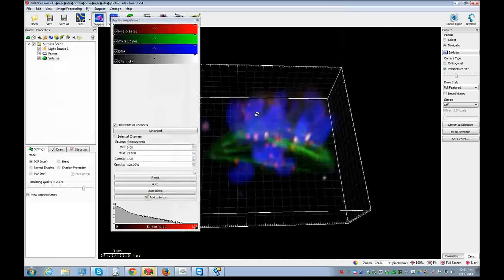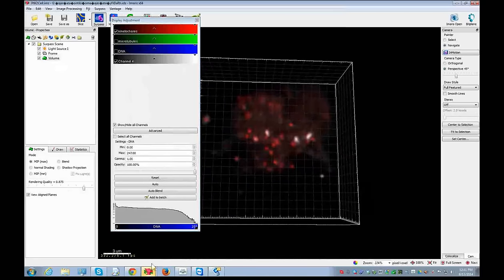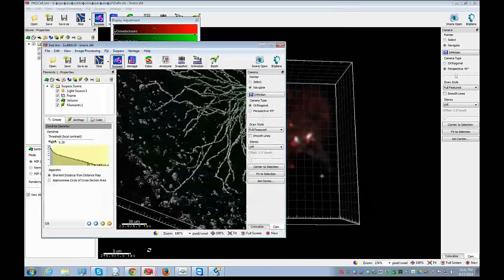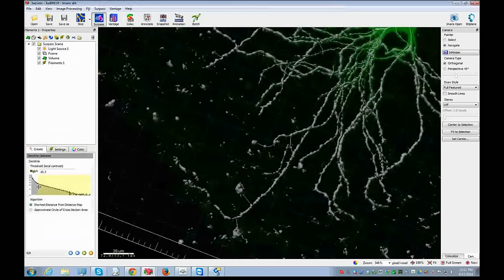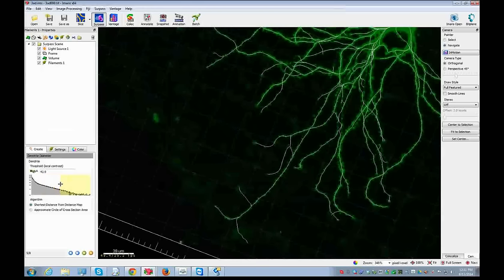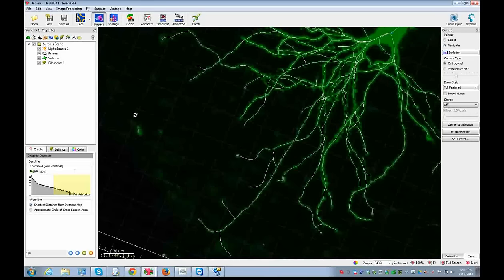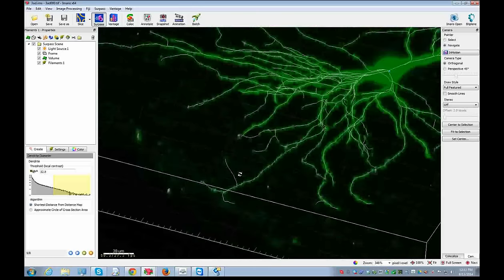Yeah, we can do this quite quickly using the PK2 sample. Here, let me see if our filament, okay, good, our filament is ready for the next step. So as I change this threshold for determining the diameter of the filament, and as I bring this up, you can see where the paths for the filament have been created. And you can see these filaments out here have been excluded, but some of these separated structures were a little bit closer, and so those were included.